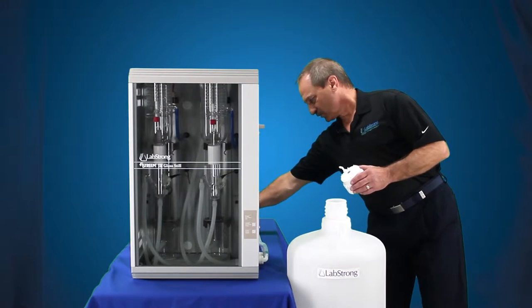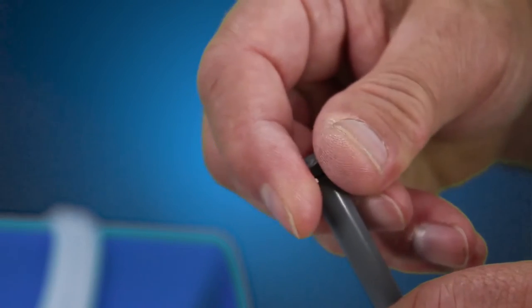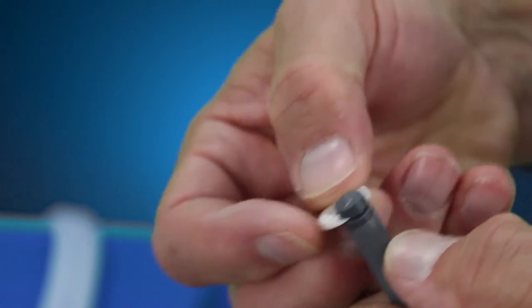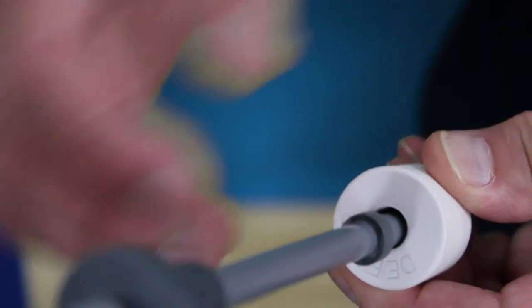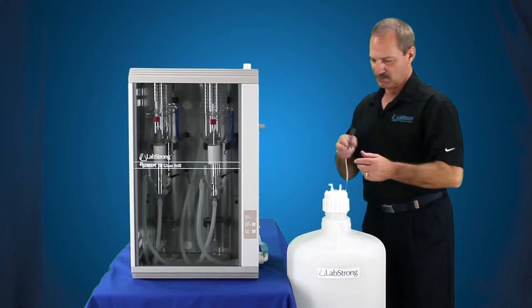You want to grab your float switch, which comes with the still. First thing you want to do is remove the clip at the bottom, take the float off. There's a top and a bottom to it — there's writing on the top, there's nothing on the bottom. That has to be reoriented back onto the float switch correctly.